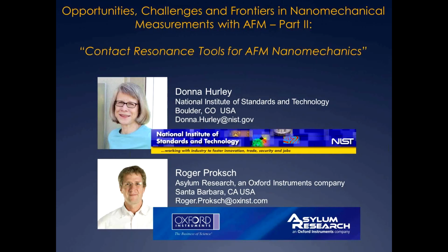Our topic today is Contact Resonance Tools for AFM Nanomechanics. We're honored to have Dr. Donna Hurley joining us as co-presenter today, along with Dr. Roger Proksch. Dr. Hurley leads the AFM Nanomechanics project in the Material Measurement Laboratory at the National Institute of Standards and Technology in Boulder, Colorado.